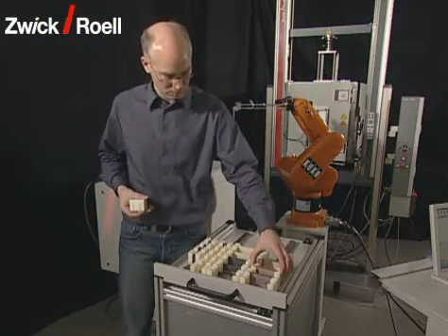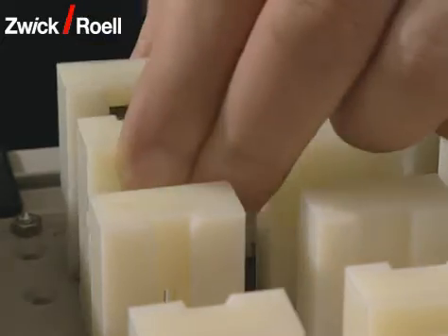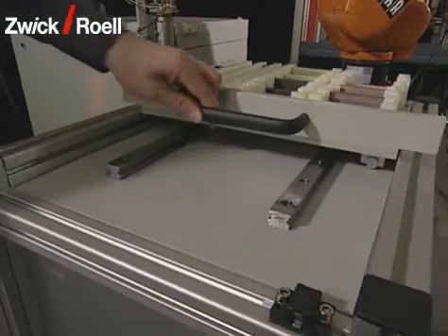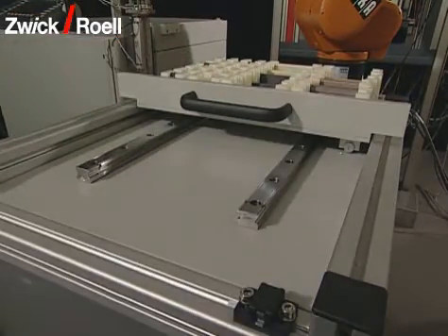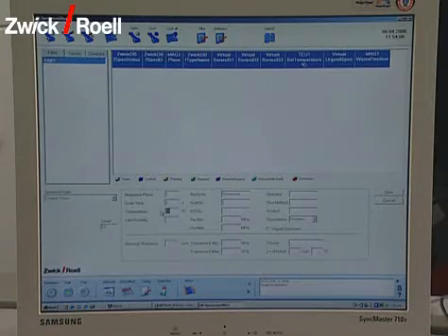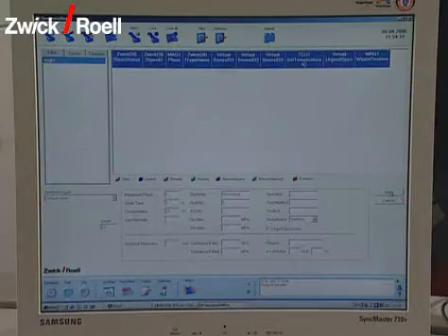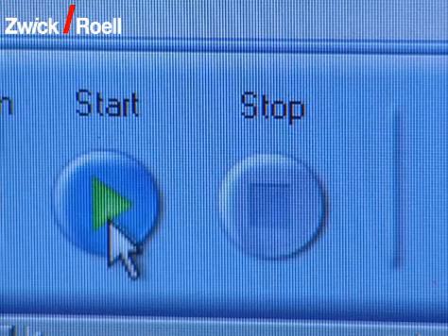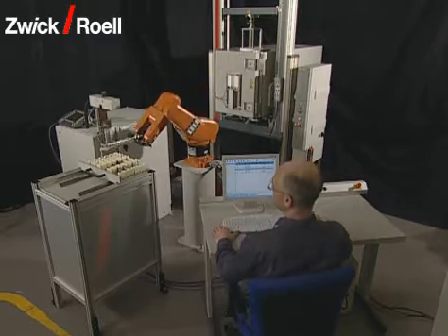A specimen runs through the following sequence. Firstly, the operator sorts the specimens into a removable carrier. By pushing in the drawer, the specimens are brought into the working range of the robot. Then, the data of the test series is entered into the computer by the operator. Alternatively, this data can also be transferred automatically from a higher order host computer. The starting of the unit is triggered with the button on the operator panel of the software.